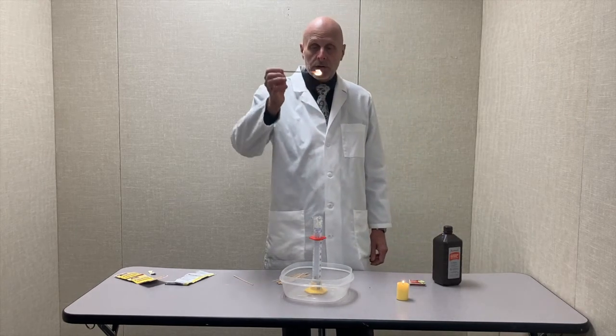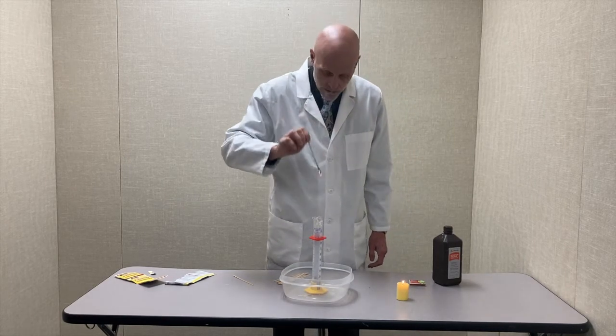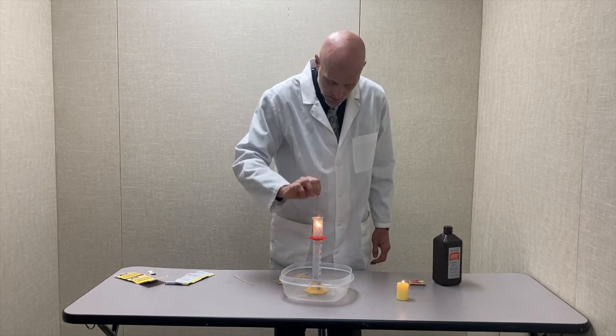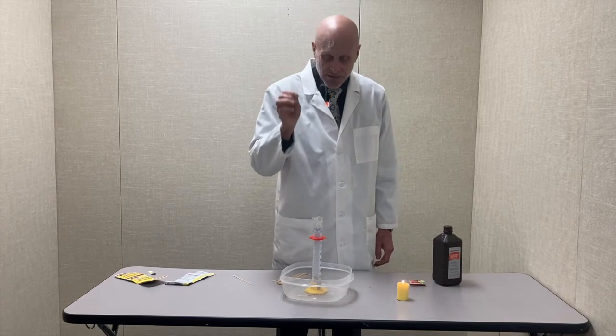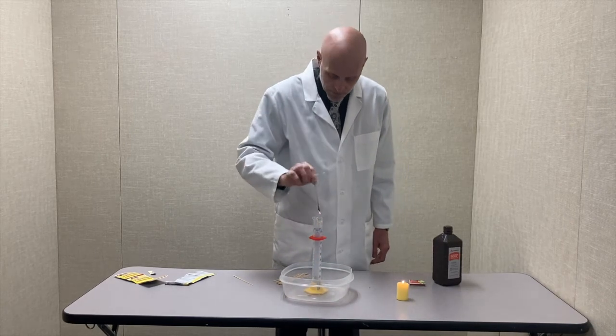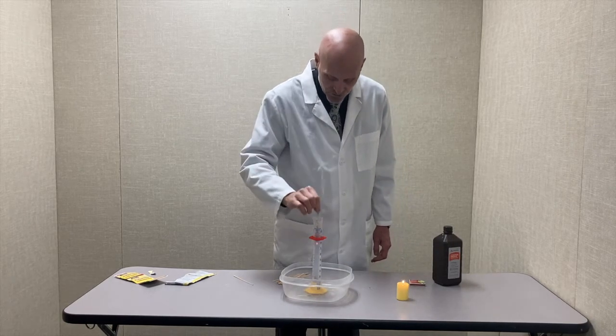Once I do, it'll start to glow orange on the end. And I'll blow it out. And it relights. Notice when it relights, it changes from a yellowish orange flame to a bright white flame. And it happens over and over and over again.